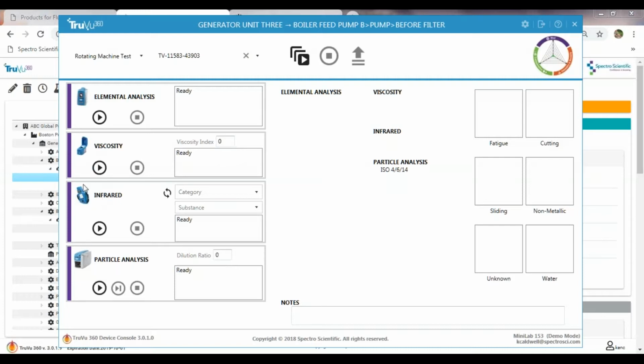Since we have an asset tree that you tagged with a component type, it knows what kind of machinery it is. For example, rotating machinery will have a certain set of test instrumentation, including particle analysis. Our standard engine test suite does not use particle analysis. Of course, you can control the individual operation, but for right now, I just wanted to demonstrate that aspect of it.